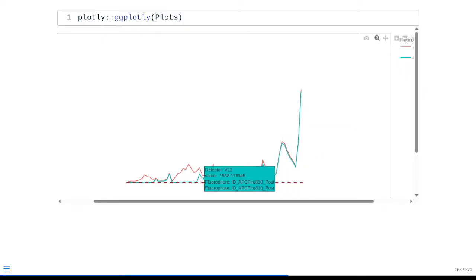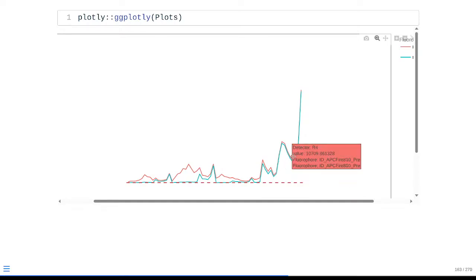So when we subtracted out our background, we lost a little bit of the signal for the UV7, the violet 7, and the B3 detectors, but there is still something quirky in comparison to the reference signature in terms of the R1 and the YG4 detectors.